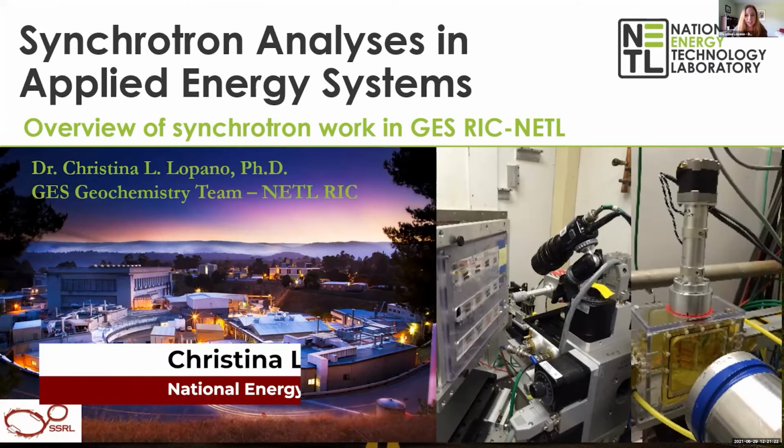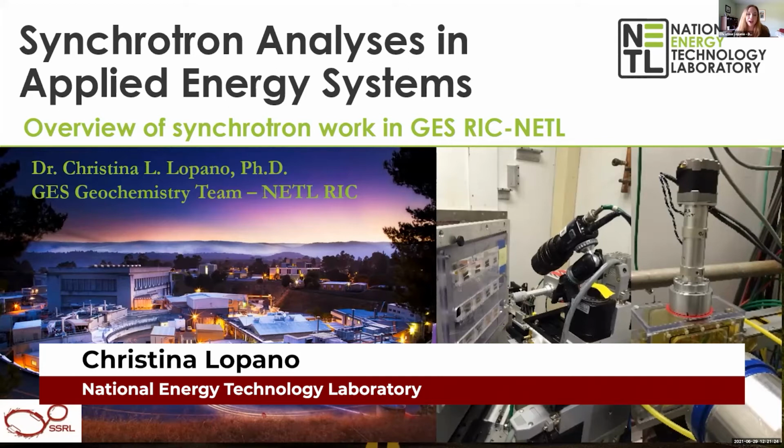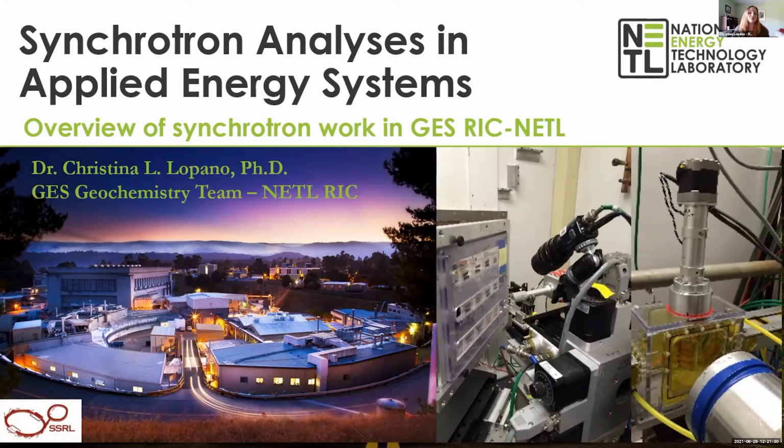All right, thanks a lot. Thank you for having me. I think I was brought here today to give you an idea of how we utilize synchrotron analyses in sometimes very messy applied fossil energy systems. So I'm going to give you an overview of the synchrotron technologies we utilize in the Research and Innovation Center's Geologic and Environmental Systems Directorate, which I'm part of at the National Energy Technology Lab.